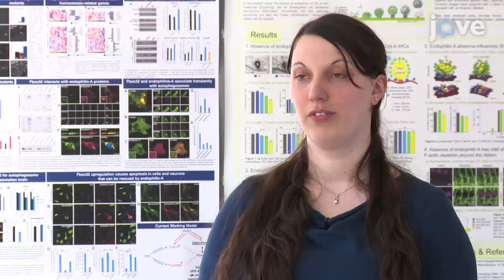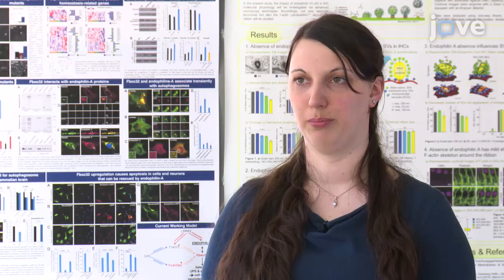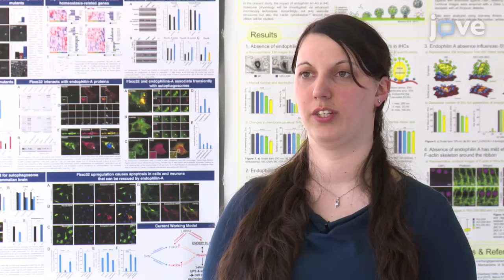This method can help answer key questions in aging and neurodegeneration research, such as the onset and progression of gait and motor abnormalities with age, and in particular, in mouse models of neurodegenerative diseases. The results of such studies can be translated towards better understanding of motor impairments in patients with neurodegenerative diseases, for example, Parkinson's disease or ataxias. The main advantage of using video-based gait analysis is that it allows studying both subtle and severe motor impairments in mouse models of neurodegeneration.